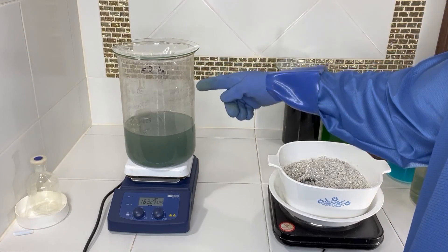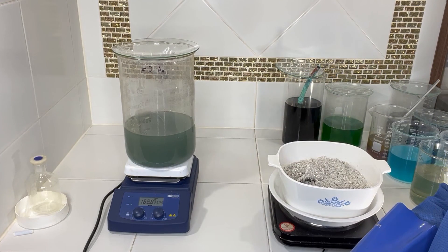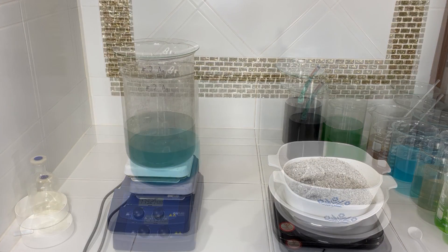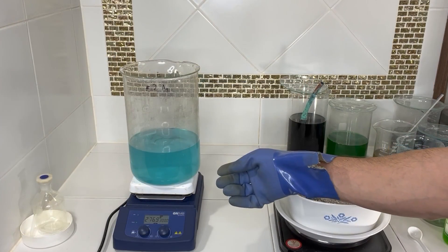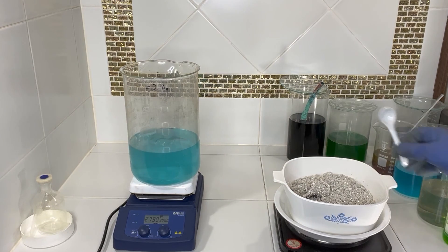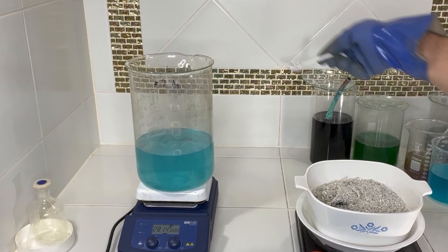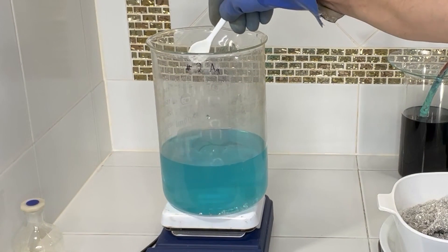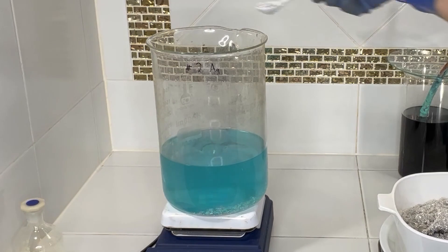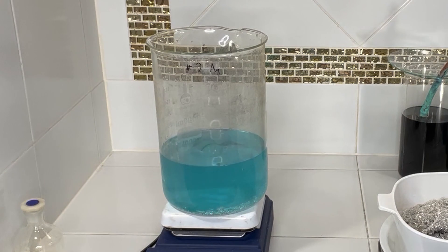This will clean off any residue on the beaker, it'll also dissolve a lot of the silver in the bottom, and it helps clean up the whole system while reactivating the silver nitrate. With just 30 milliliters of nitric you can see that's totally cleared up our solution. Now I want to put some of our silver back in, and when it's all dissolved but there's still a little excess of silver left, we'll know that our solution is ready to go back in.